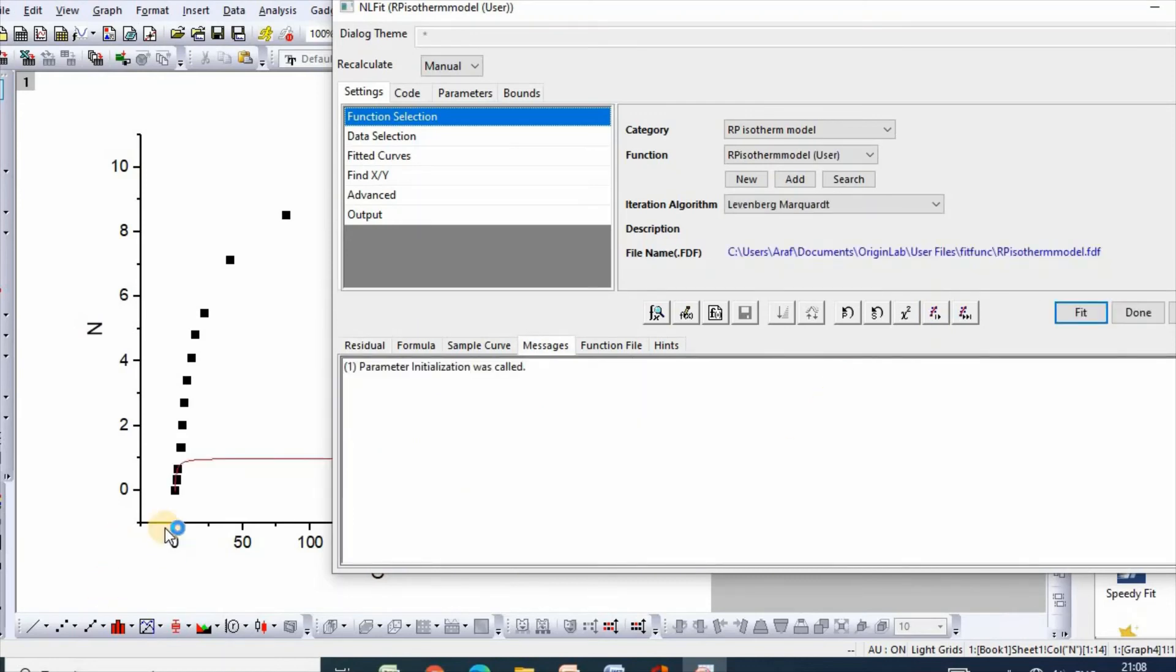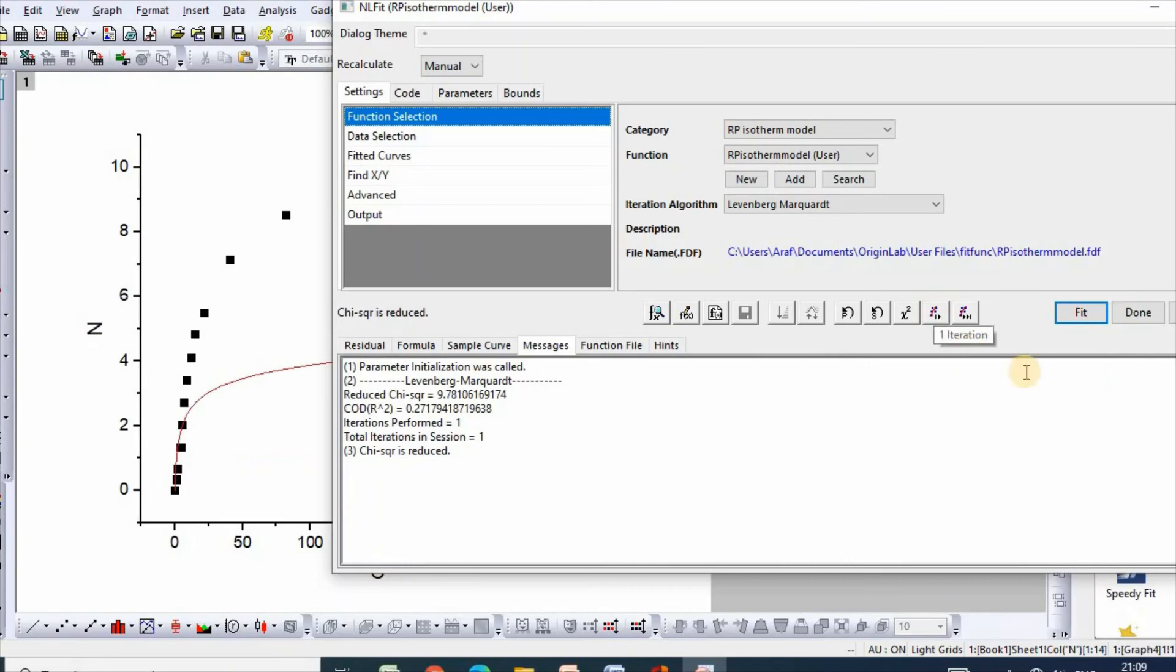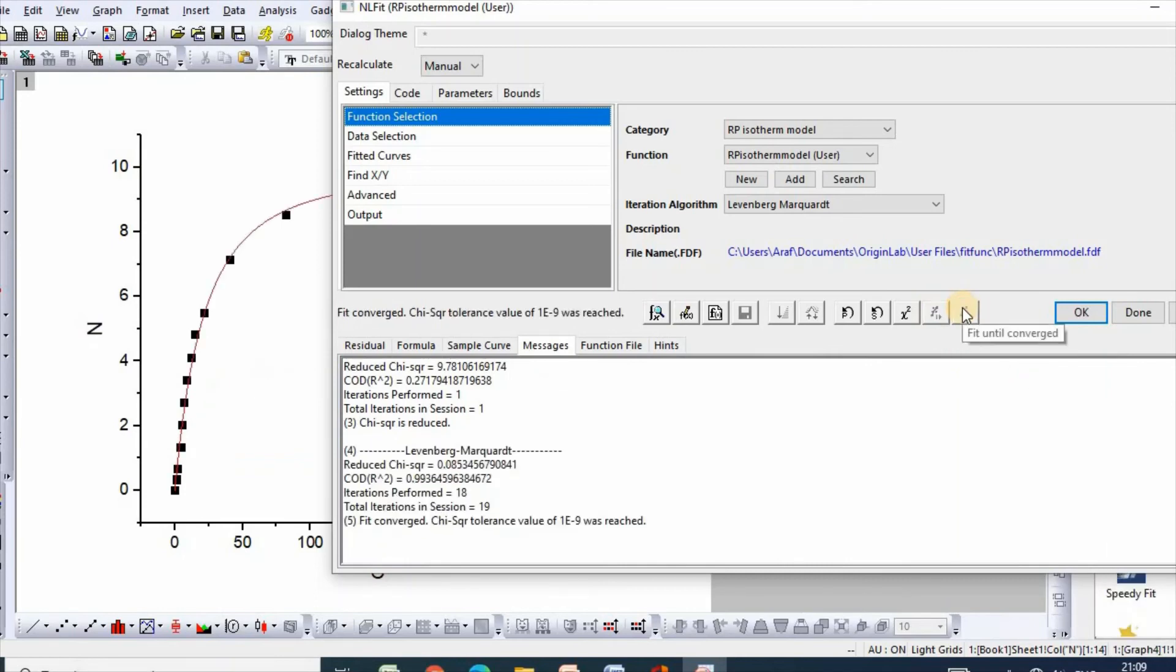It is being fitted. Then click here for one iteration. Then click Fit Until Converged.